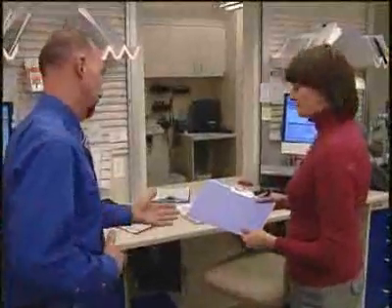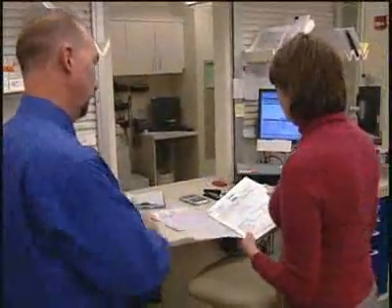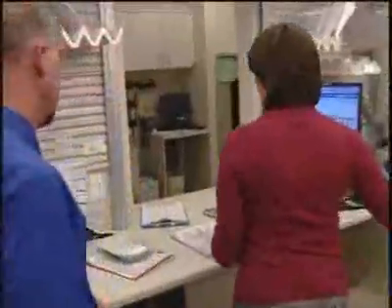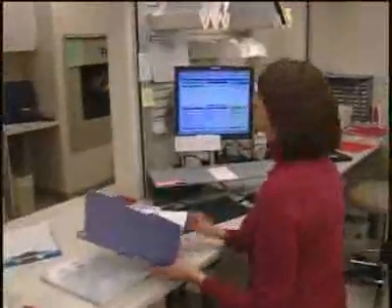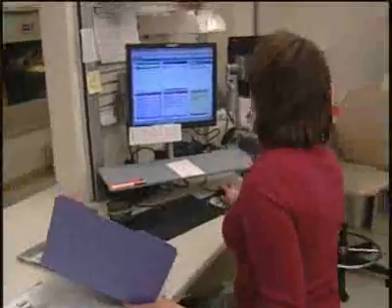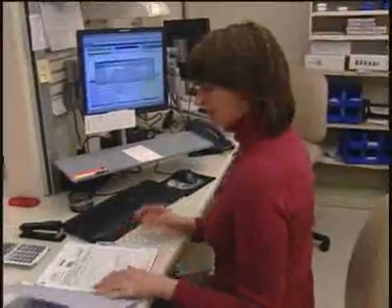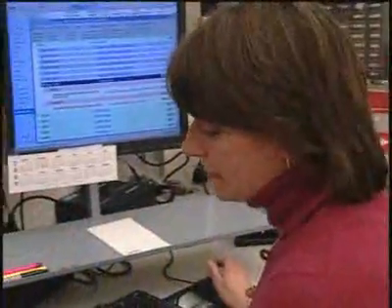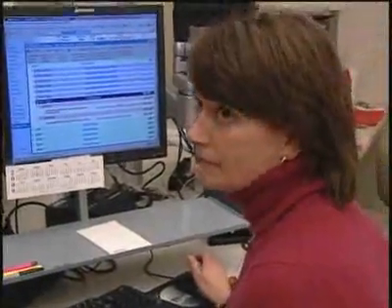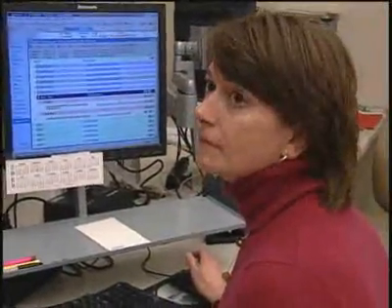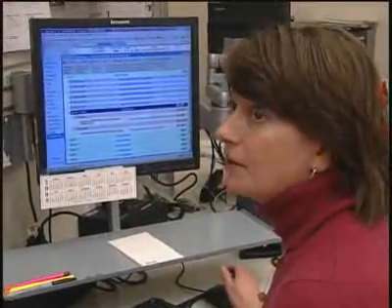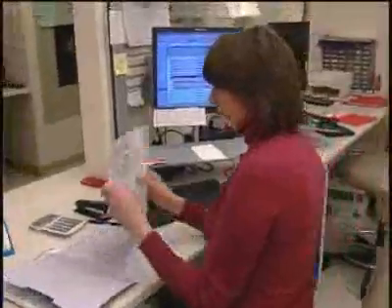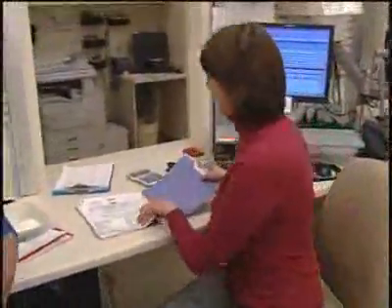Okay Debbie, I see you got a new prescription. Can you just kind of walk us through the process? The nurse signs the patient in so we know they're here and they're ready to go, and then I'm going to pull up their treatment plan in the computer. This is coming across from your hospital pharmacy management system. As soon as you release that, it's going to show up in our ScriptPro system based on the drug type or some tag. Correct. So now it's going to print the label and show up in our ScriptPro system. I'll go back and get it and give it to the technician.